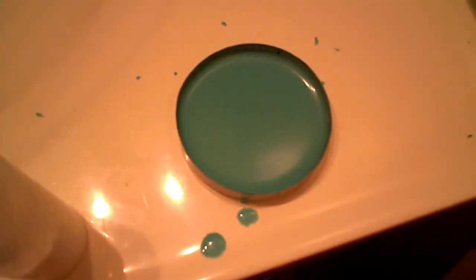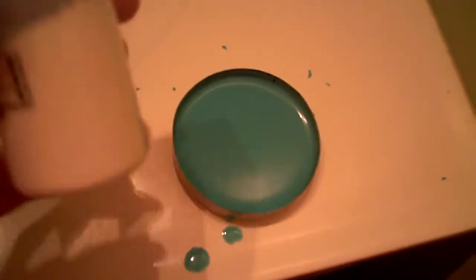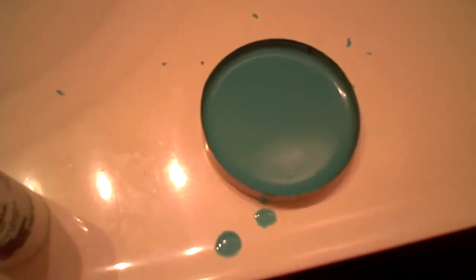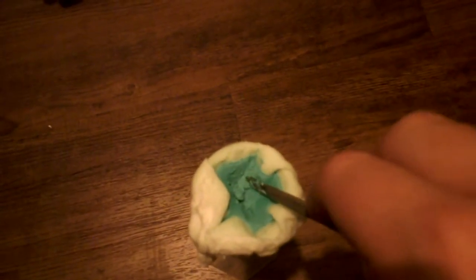After we have added all the sodium bicarbonate, we are left with a pale blue precipitate of copper carbonate. I will filter this off, and I'm left with this pale blue precipitate in my filtering thing.